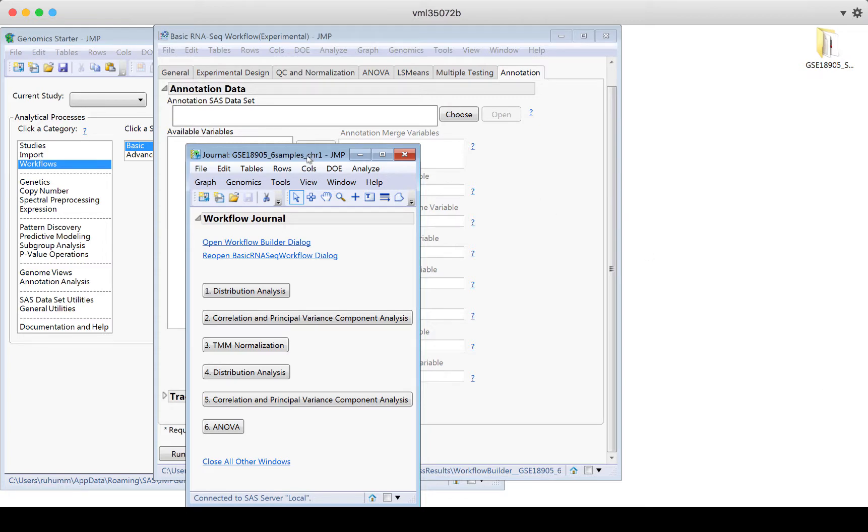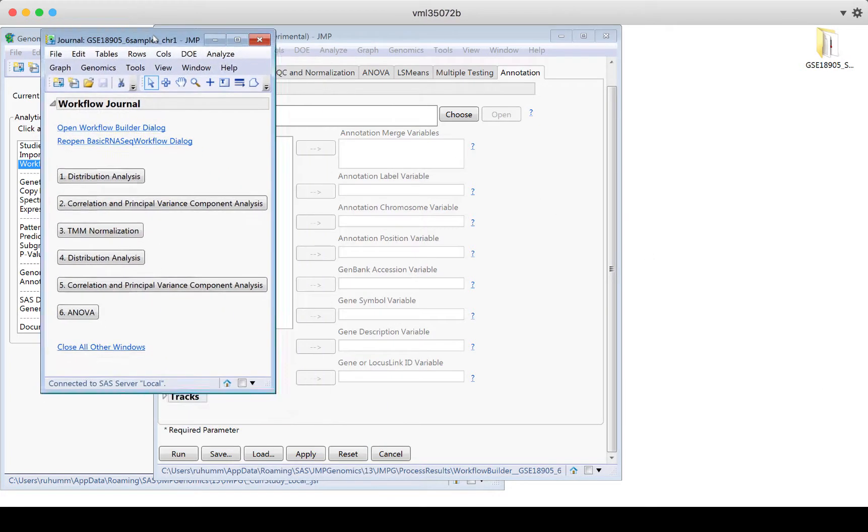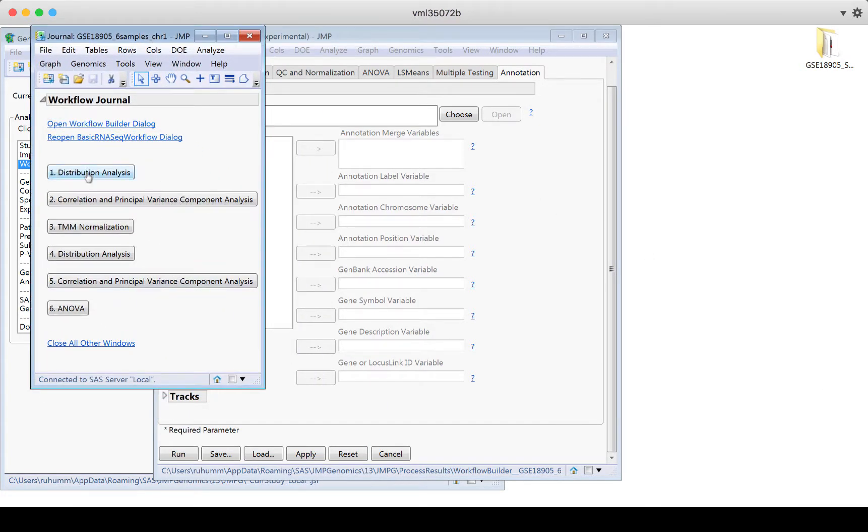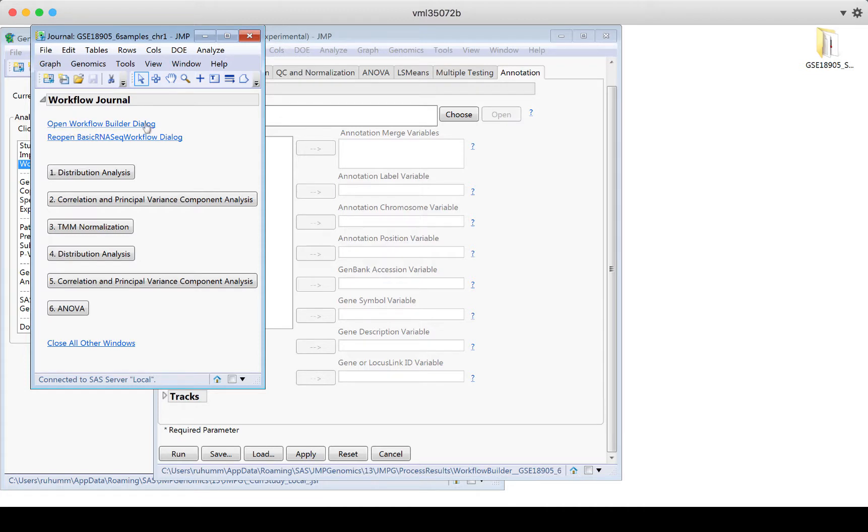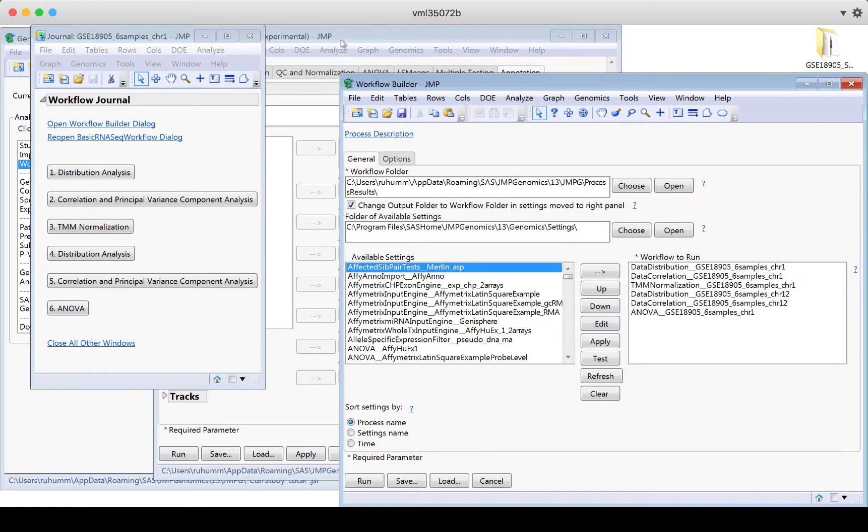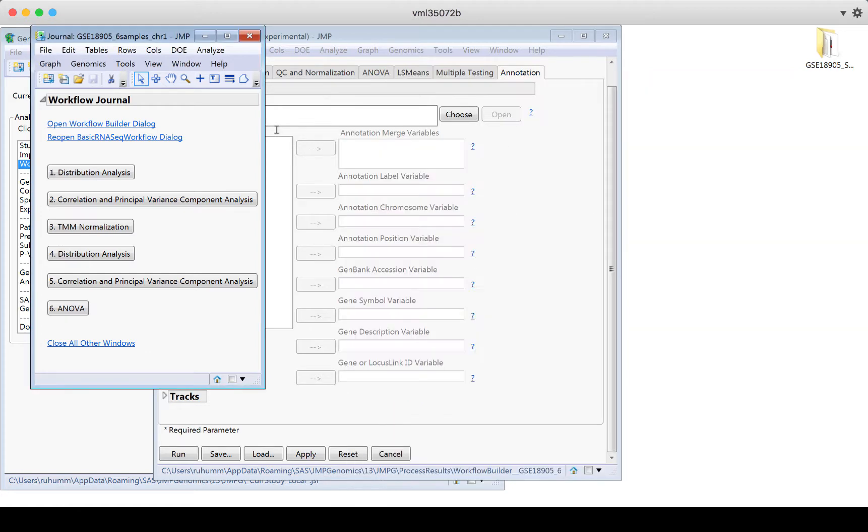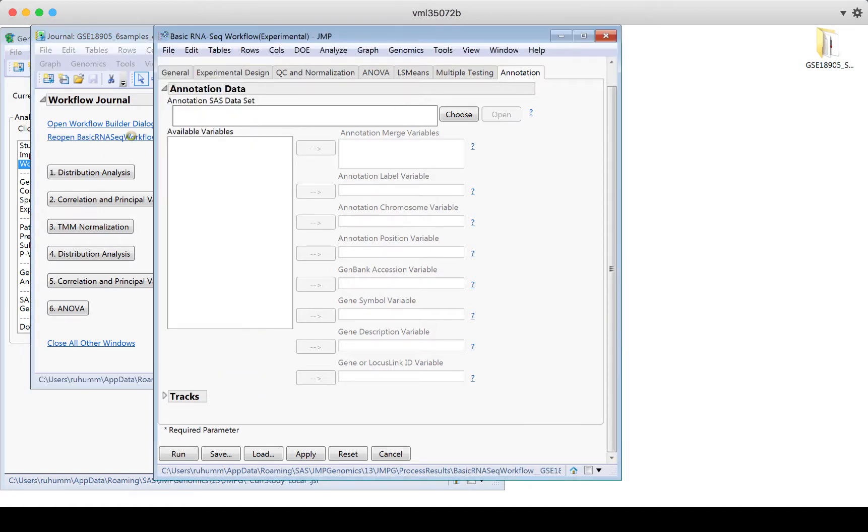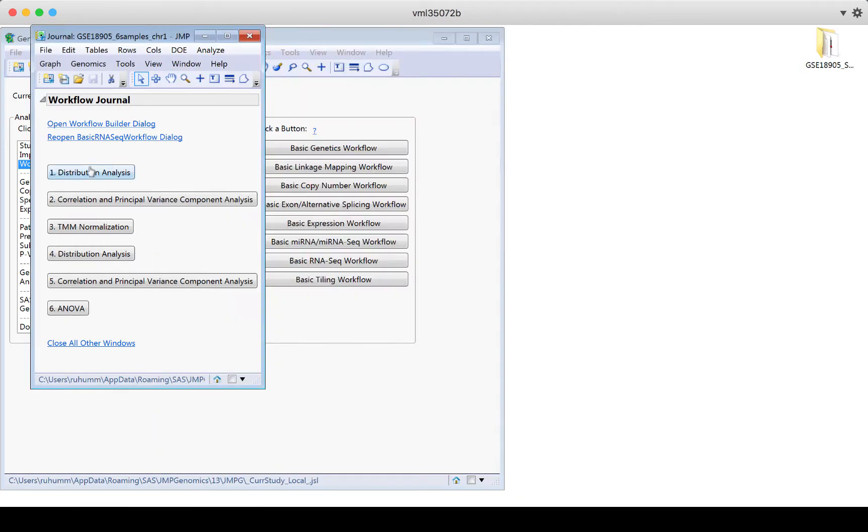So here's the output. It output into a journal for us. If I click on these buttons, so a journal is a way to save your reports in jump. It's a special jump file extension, a dot J R N file extension. So this journal, if I click on open workflow builder dialogue, it's going to reopen the workflow builder dialogue. So I can ask to reorder things or I can change things. I can edit the options and so on. I can also reopen that workflow dialogue. This one that I have in the background. If I click on this, it just opens that dialogue again.